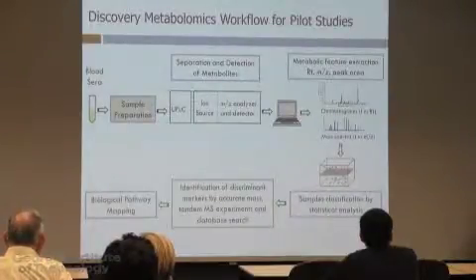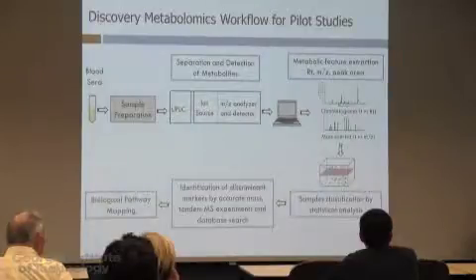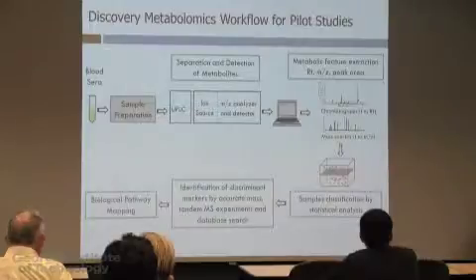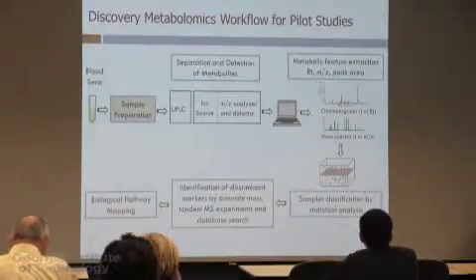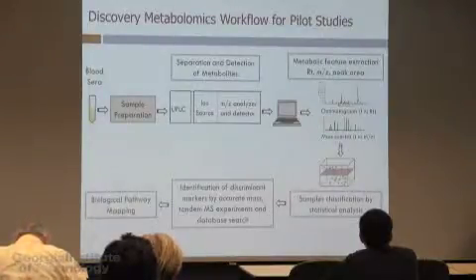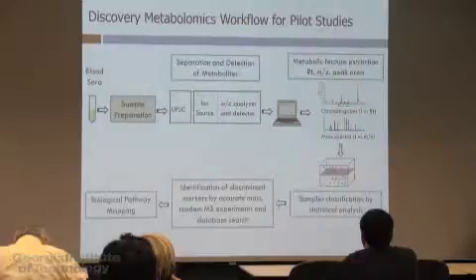And then at the end, you talk to your collaborators and you're like, are you sure that the cancer samples spent the same time in the centrifuge? And you see them pause for a minute and they're like, oh, I didn't realize that that was so important. That's it. It's 1.5 years of work thrown away, because if you don't keep things constant, there can be any variable that will distinguish, any sort of confounding factor that will distinguish between the two populations, and you don't want that, okay? You want to minimize that.